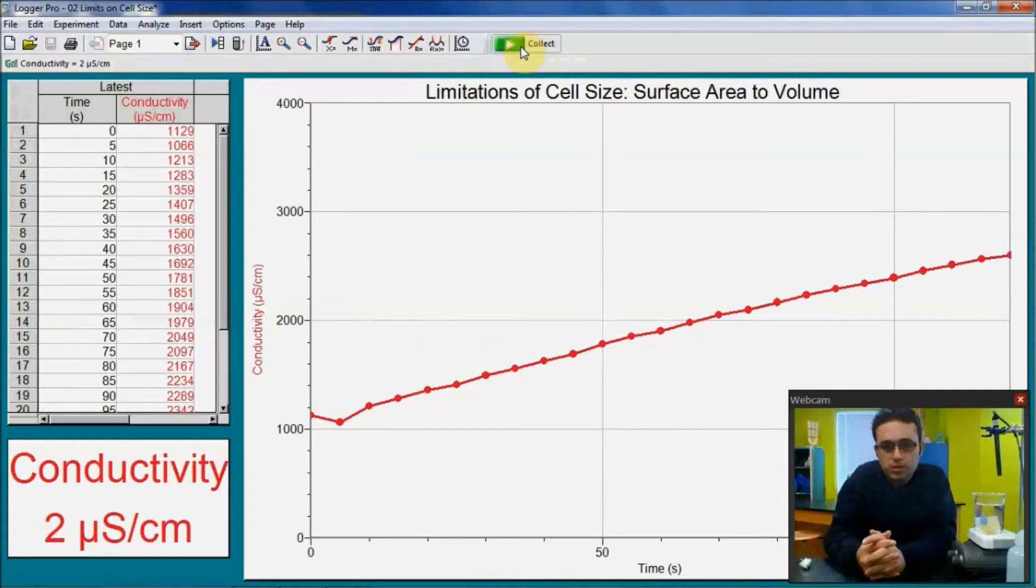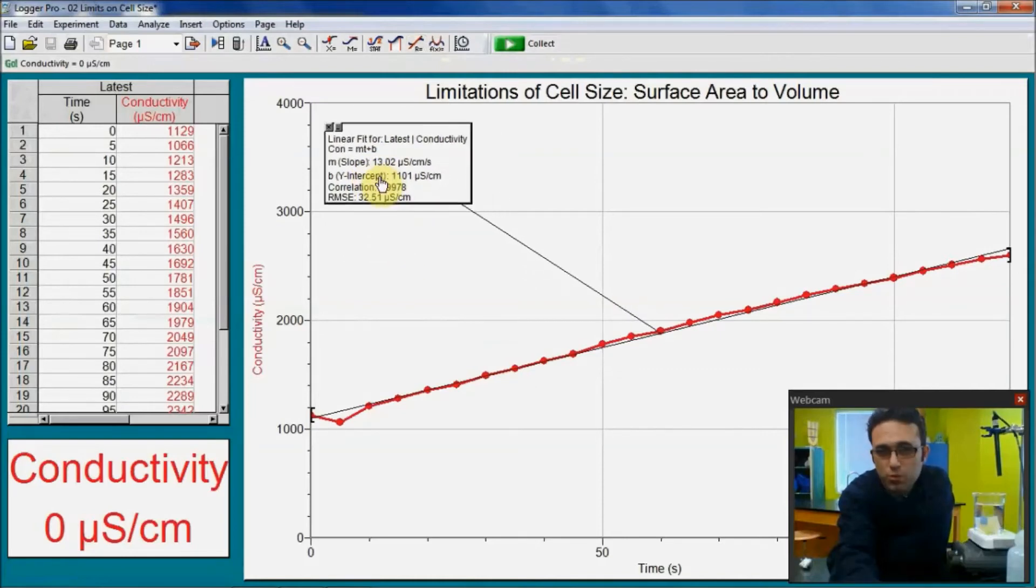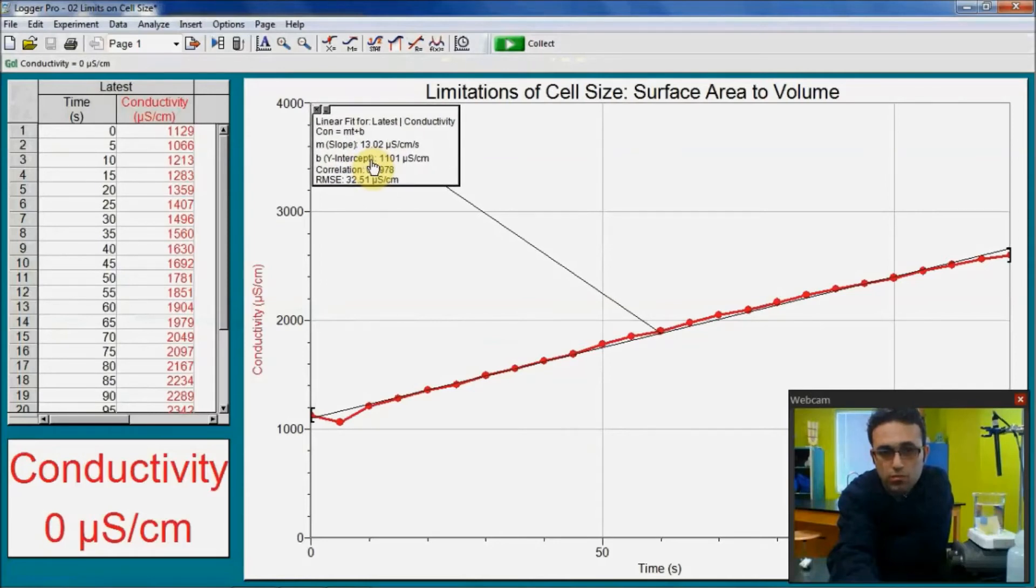When you are done with all the three runs, three different runs with three different sizes of agar cubes, you go here in the software, you click on this linear fit button where you see a function and a line that is the best fit line of this function. And it gives you the R value regression. So you do this, clicking on this, and you will have a floating box for each of the data sets. I have just one data set right now here. You move it around wherever you find it convenient. But this is the slope of the best fit line and this is the y-intercept of the best fit line. So here is the part of the experiment, Limitations of cell size. And I hope this will be helpful with your experiments.